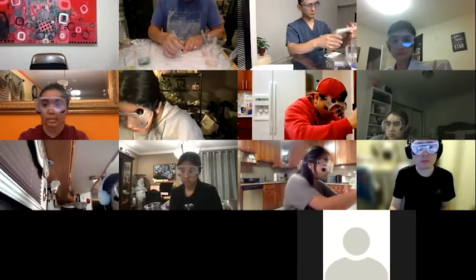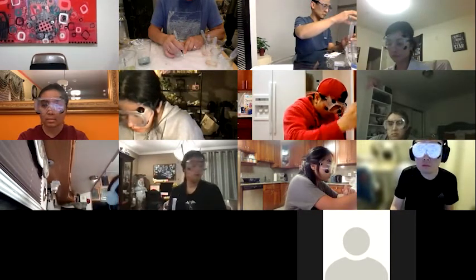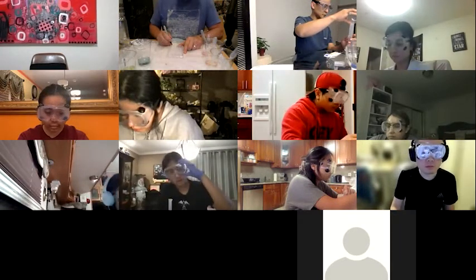You can just go right ahead and write on the plate if you want. I'm just going to put a T for top here so I'll know what the orientation is. Actually, T for top is good enough.